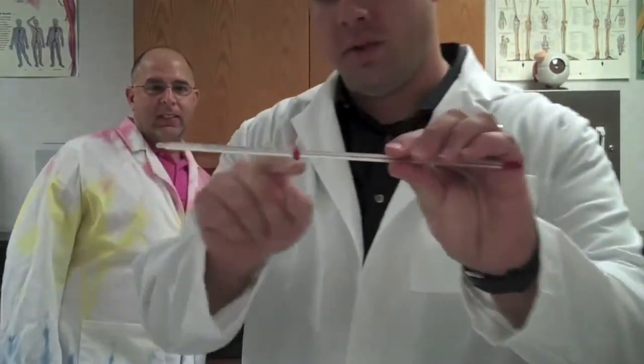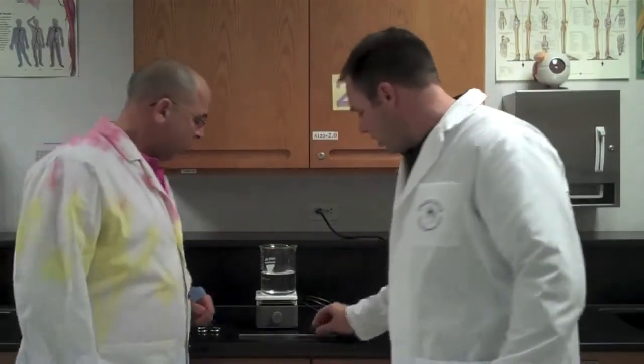It has this little red piece on here. You can see right here in the middle. It's triangular. It's going to keep the thermometer from rolling off the countertop.